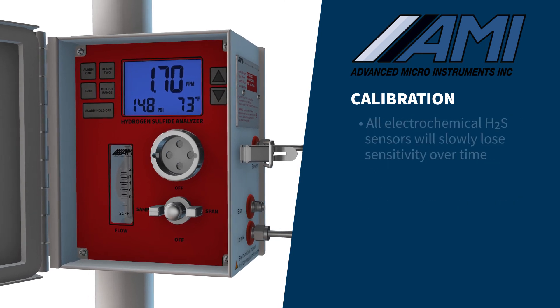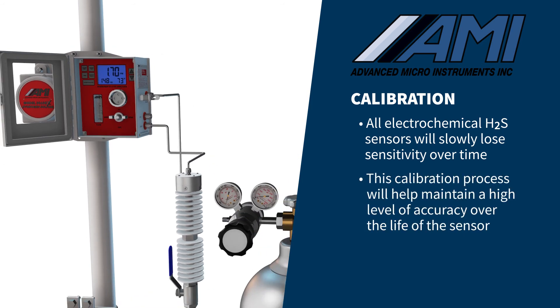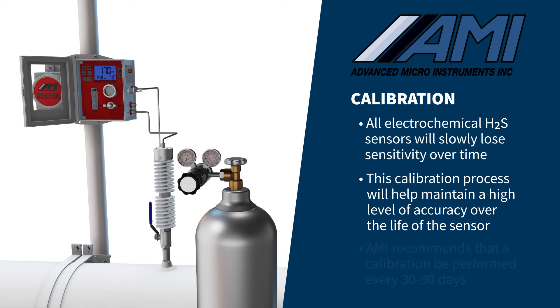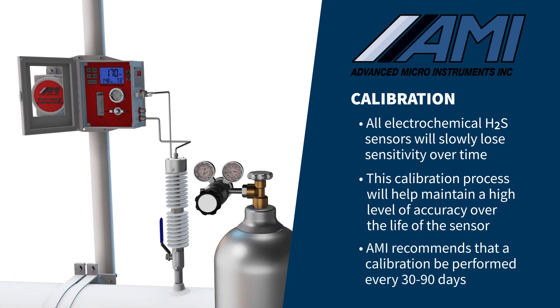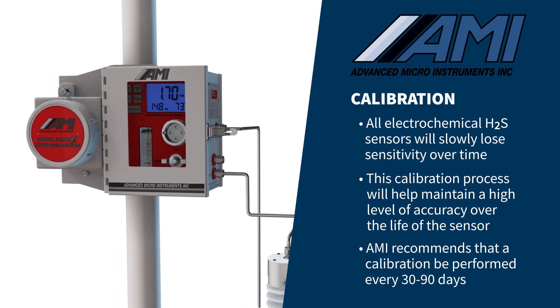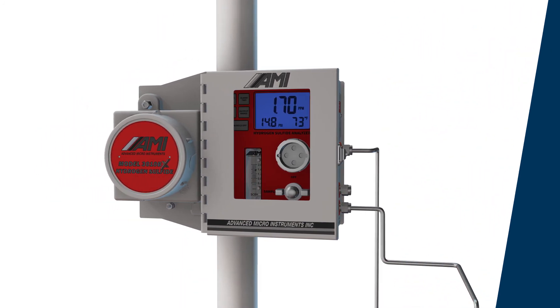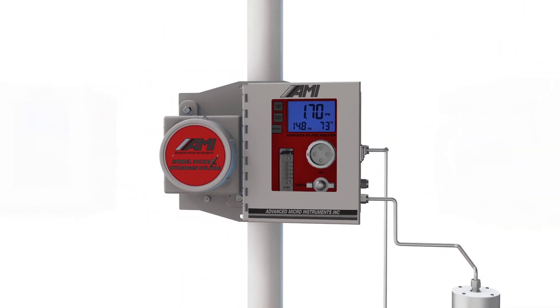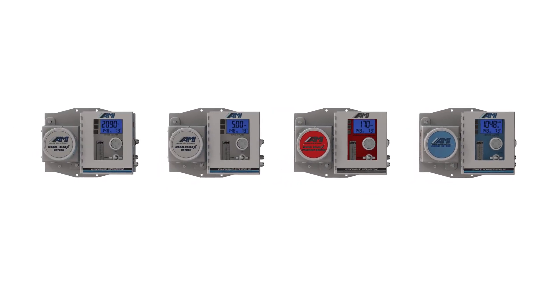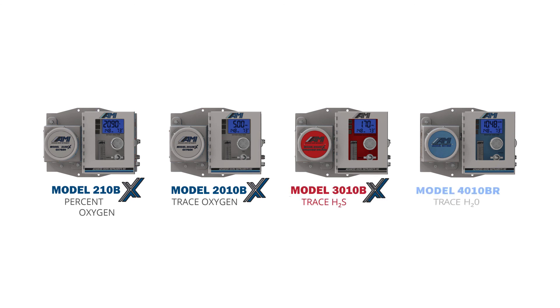All electrochemical H2S sensors will slowly lose sensitivity over time. This fast and simple periodic gas calibration will maintain a high level of accuracy over the entire sensor life. AMI recommends a calibration be performed every 30 to 90 days depending on the H2S concentration and methanol concentrations in your sample gas stream. Proper installation and calibration of AMI sensors will ensure the accuracy and long-term high performance that AMI analyzers are known for. Let AMI help you with all of your oxygen, hydrogen sulfide, and moisture analyzer needs.